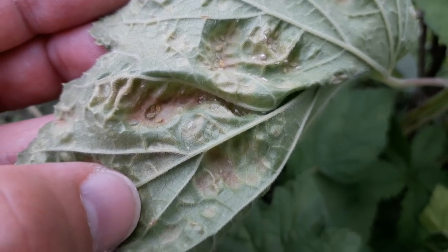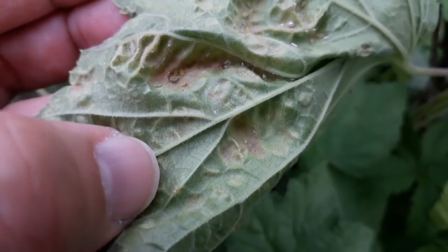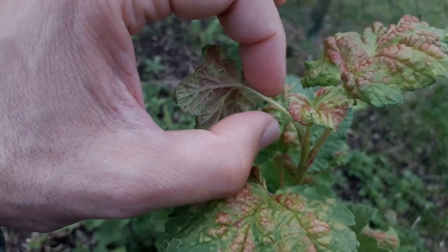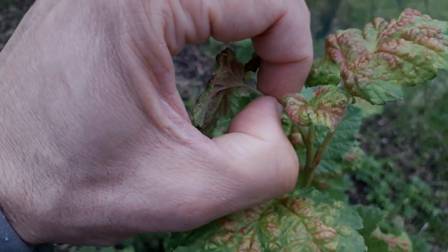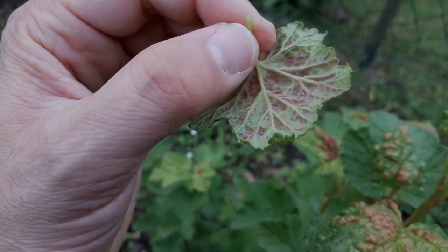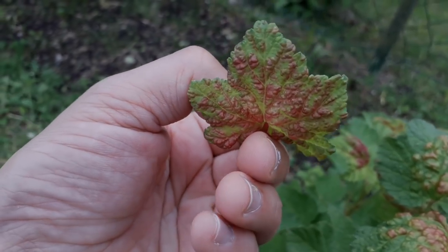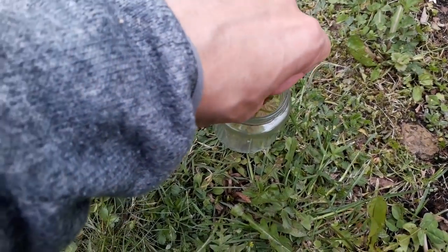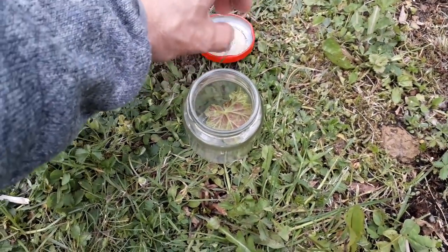A little bit larger you can see these aphids — they don't move around really. They're just sitting there sucking the sap of the leaf. So I decided I'm going to pick one of these leaves and put it under the microscope for a closer look at the aphids. I put the leaf carefully into a glass jar so I can take it home to my home lab.